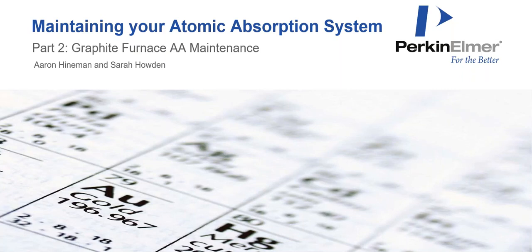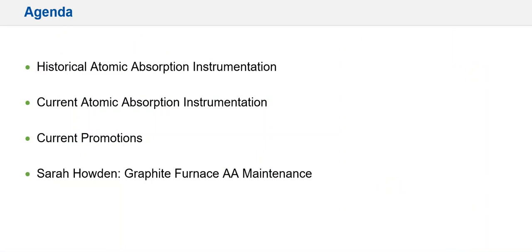Today we'll be going over Graphite Furnace AA maintenance. I'll first give a bit of an overview on the atomic spectroscopy line of products, a bit of a historical review on AA instrumentation, our current AA instrumentation, talk about promotion really quickly, and then get right into the meat of it, where Sarah Howden will be discussing Graphite Furnace AA in more detail.